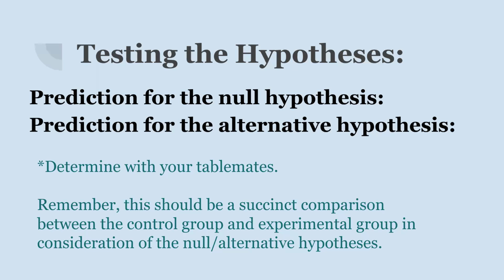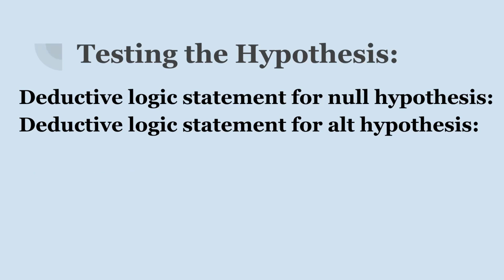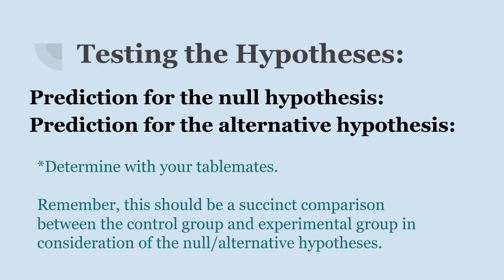And again, you could talk about how that applies to me being a morning person or a nighttime person. Sorry, that was more along the prediction that I gave you. So the statement for the null hypothesis would be more along the lines of there is no huge difference between the banding that is seen for the control group as compared to the experimental group, in that this person is not a nighttime person. And then for the alternative hypothesis, it would be that there is a big difference in the banding, and that this person is a nighttime person.